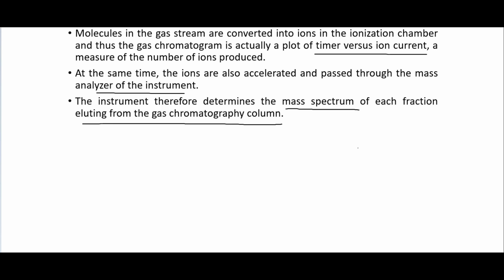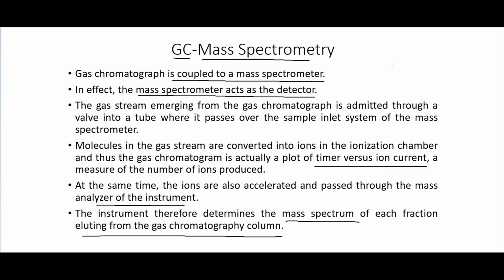Like I said, this is a very common instrument used in organic chemistry labs. Your school, if you're taking this as a sophomore level organic chemistry class, might actually have a GC mass spec in their laboratory. And so this is something that you might use. And if you're reading papers in organic chemistry, you might often see data given by GCMS.